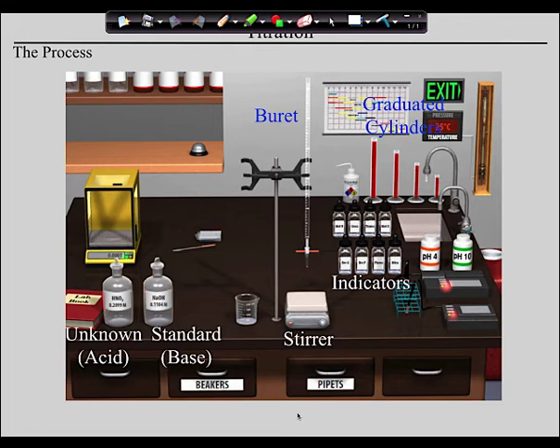They've got beakers, they've got graduated cylinders, they've got the burette. They actually have metallic burette clamps where ours are painted white. But guys, it's all just like the lab. This is actually modeled off the Chem 107 lab at BYU. Then, check out the bottles. So guys, this is the way we're going to do this.